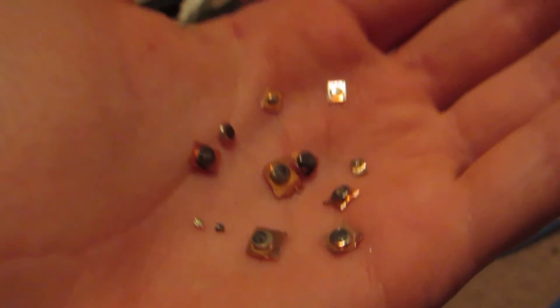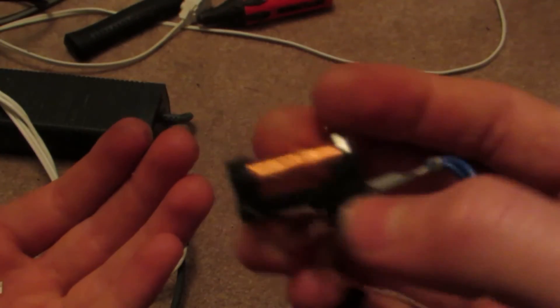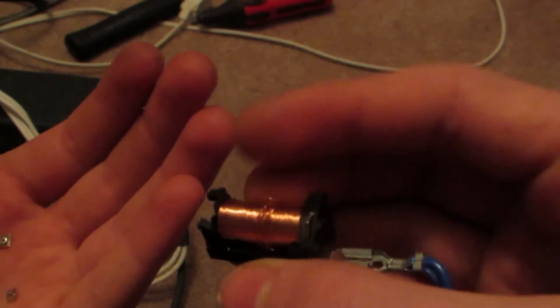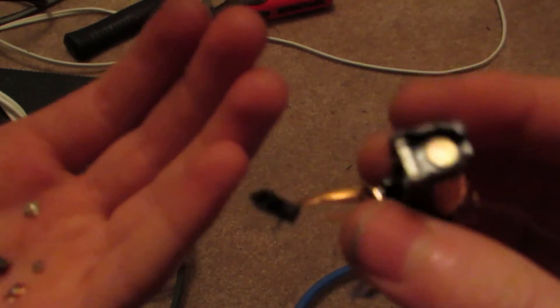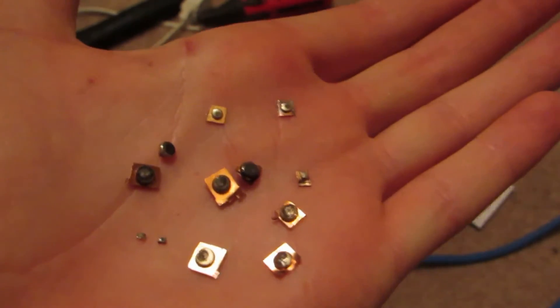If you're curious about all these coils here, it's copper, so you could save it. I'm just going to toss it out because I already have plenty of copper. Anyhow, let's move on to the next step.